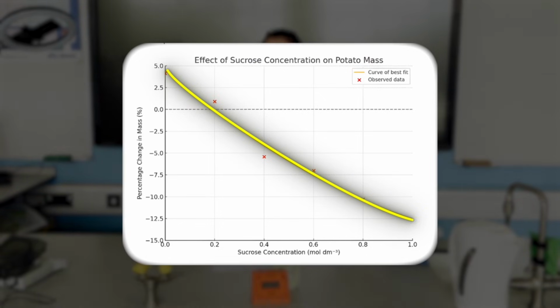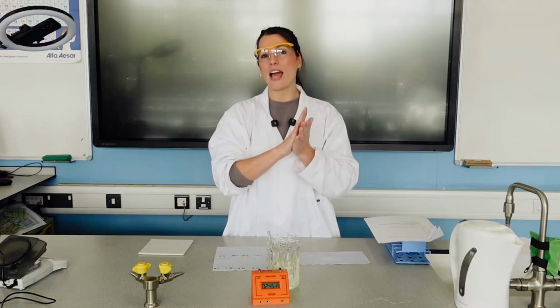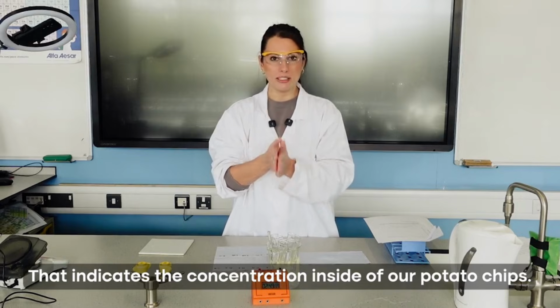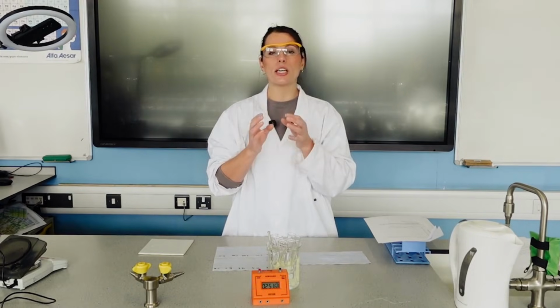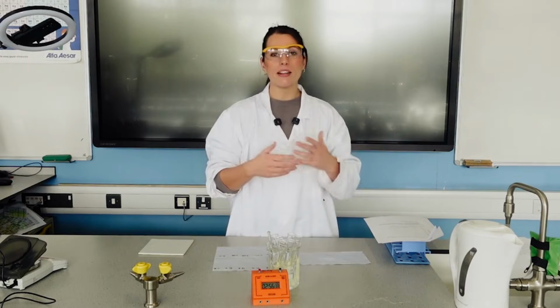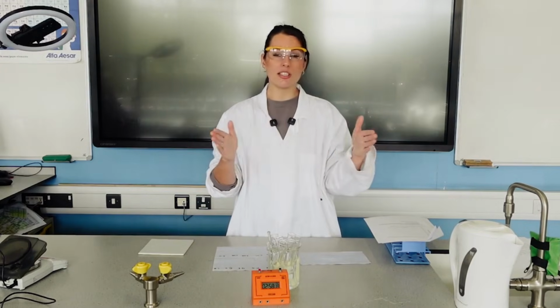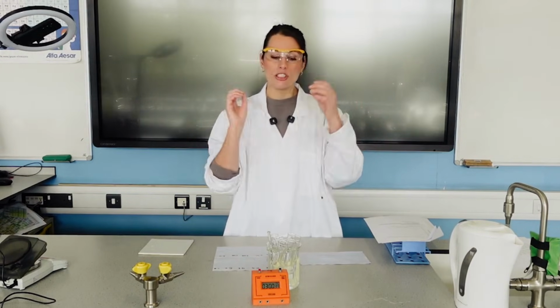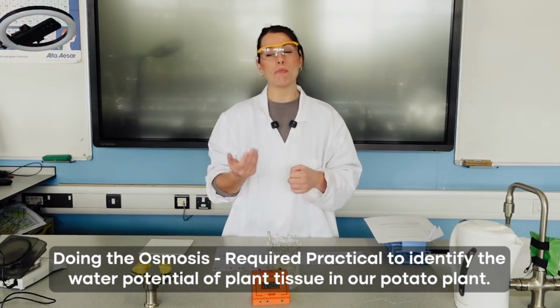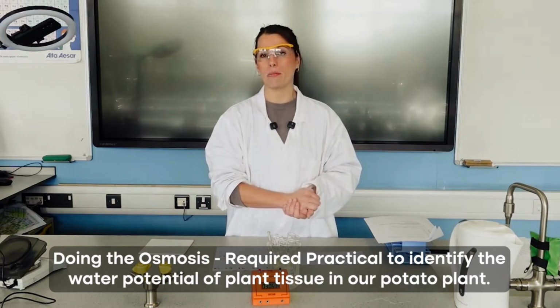And it's at the point that the line crosses the 0% change in mass, that indicates the concentration inside of our potato chips. And then we could look up for that sucrose concentration, what is the water potential? And in that way, we have used a dilution series of sucrose concentrations, doing the osmosis required practical to identify the water potential of plant tissue, in this case, our potato plant.